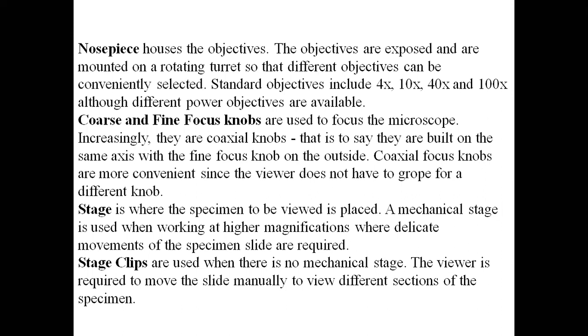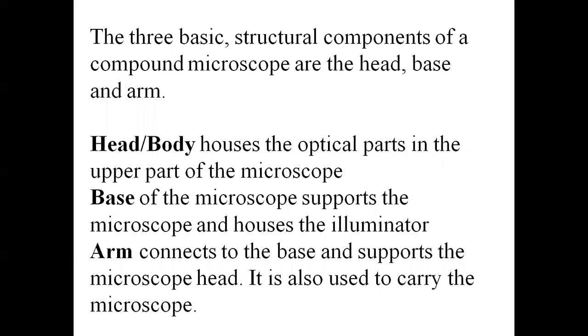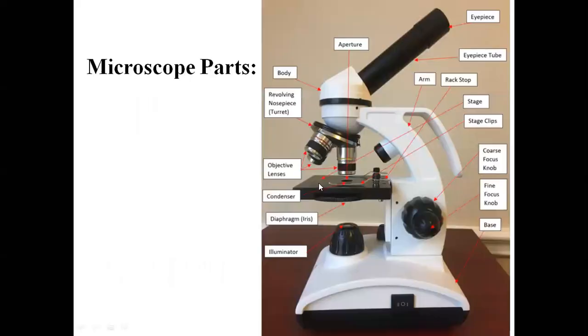But some microscopes have a fixed stage. Some microscopes have a rotating or moving stage. The advantage of a moving stage is this: if the stage is fixed, it is not going left or right, forward and backward. So you will have to manually adjust your slide on it. You have to move your slide and then only you can see the sample through this.